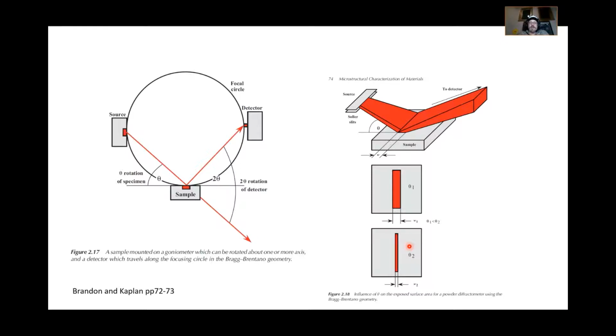Sometimes you can obscure peaks by having wider slits. So don't forget that. With wider slits, you get more signal, but you can actually obscure peaks, so multiple peaks may appear as one. You can resolve more peaks with smaller slits, but your signal is less intense as well. Bear that in mind. Commit this to memory, and you'll be fine.